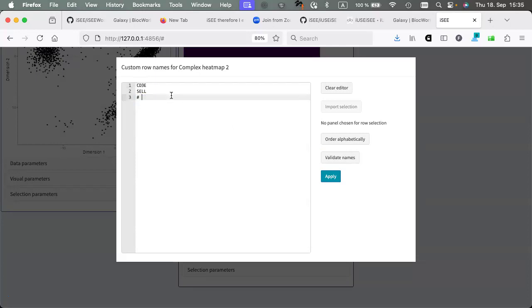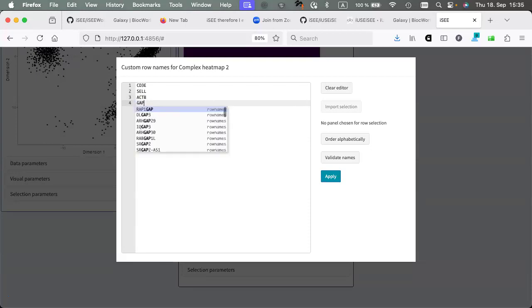So you will not have an error because the gene name will not be correct. Let's go with the classical useless ones, actin beta. You can say GAPDH. So let's go more housekeeping, but we can have ITGAM. Is it there? Let's see. It is there. So let's just select these 5 here.